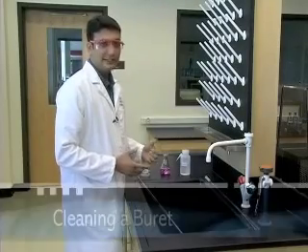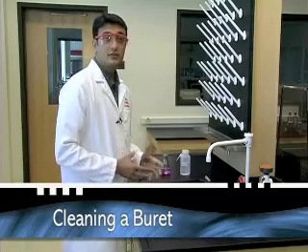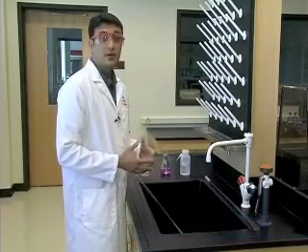Okay, now that we've done our titration, it is time to clean up. Your instructor will give you specific directions on how to handle the waste that is generated during the experiment.